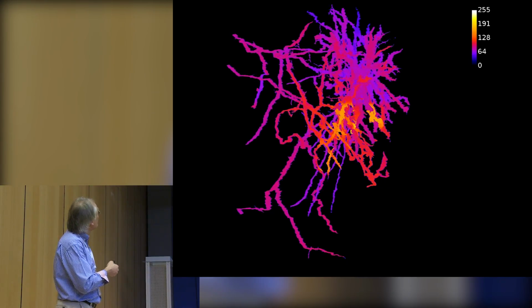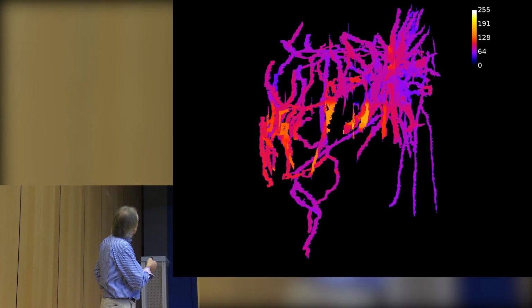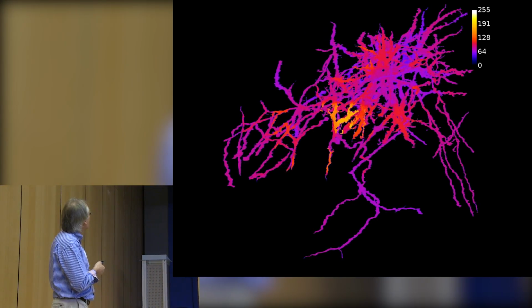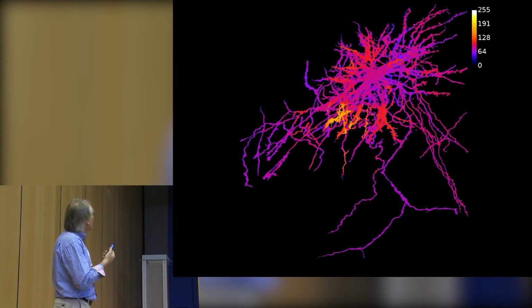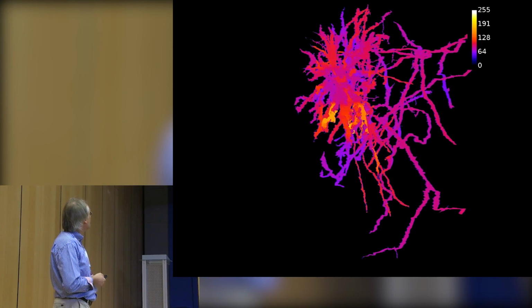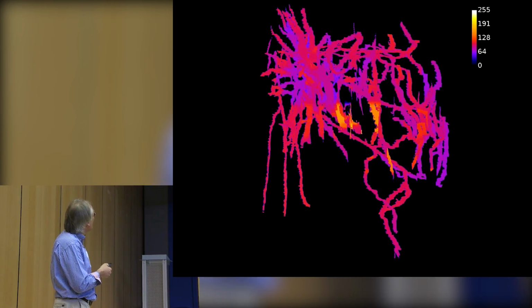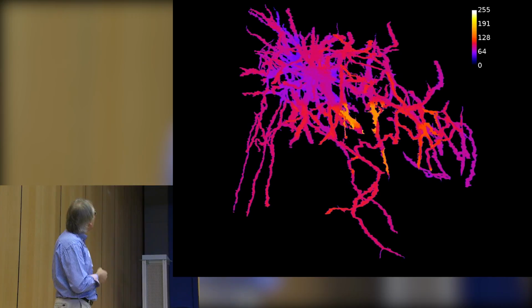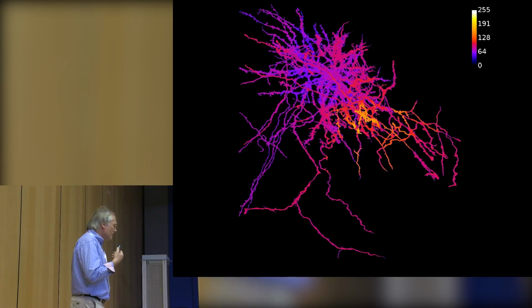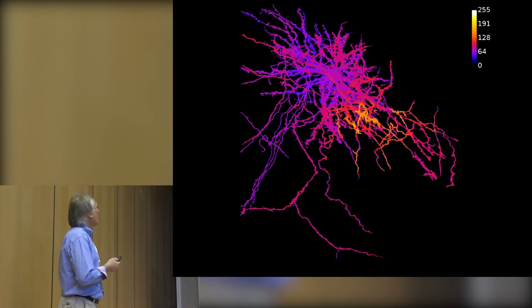So it's not that this is occurring randomly across the whole neuron, but there are zones of plastic areas like these ones here, for example, that show an upregulation of spine density. It's small segments of typically 10, 15, 20 microns length, and most of that neuron actually doesn't change. So these colors here would indicate no changes in spine density, and these bluer colors here would indicate decreased spine density. So you can see this spine density plasticity is actually organized typically in segments.